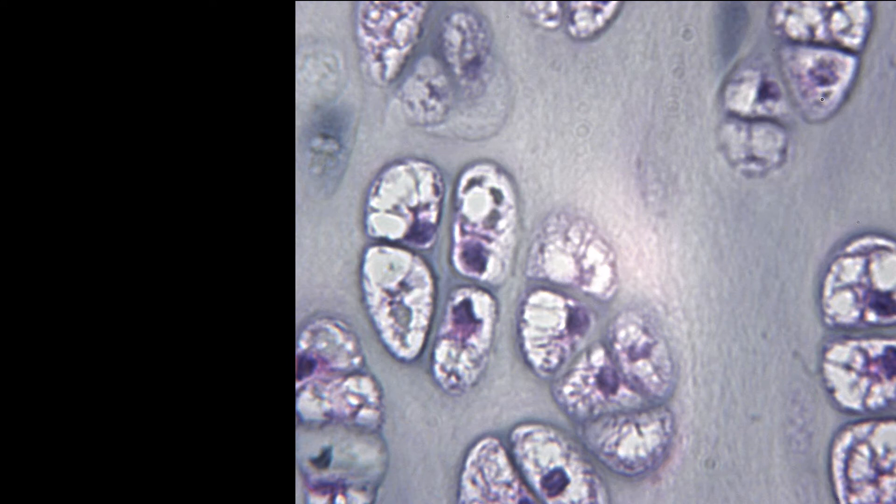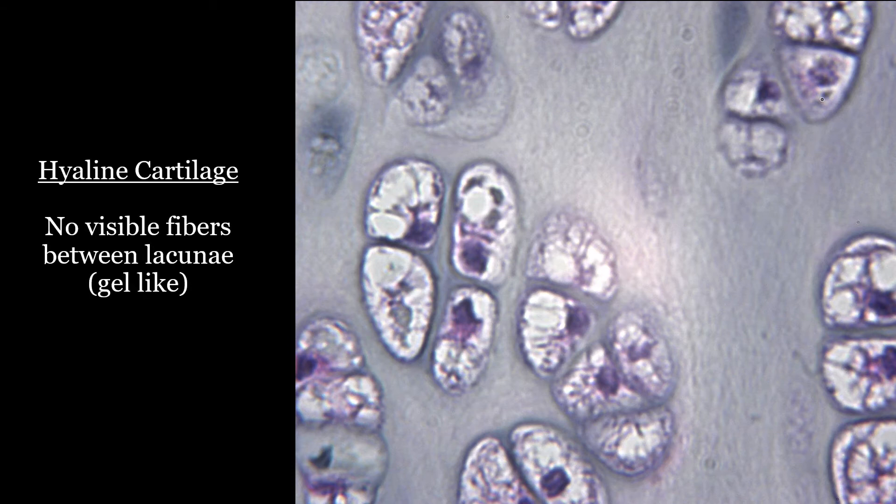All right, so what are we seeing in between the lacunae? Does it look like fibers? No, it looks more glassy, and that's how you know that it is hyaline cartilage.